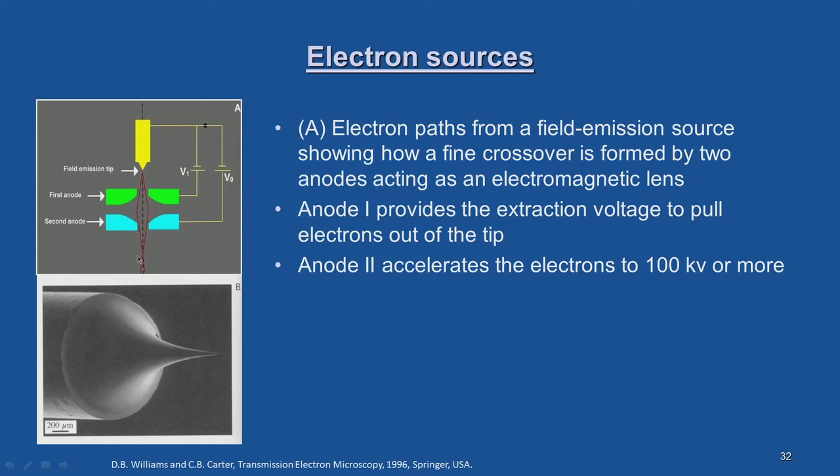You can also see a photograph of how sharp the tip is. That is why you are able to produce a very fine crossover of the electron beam.